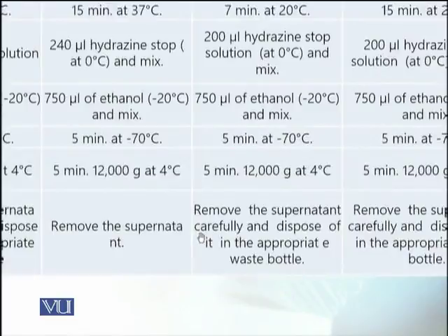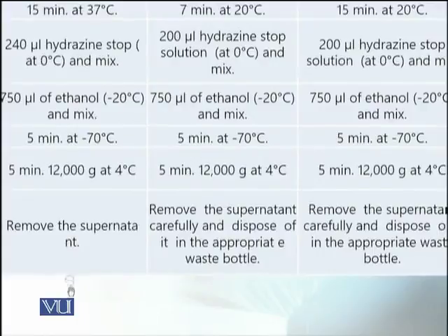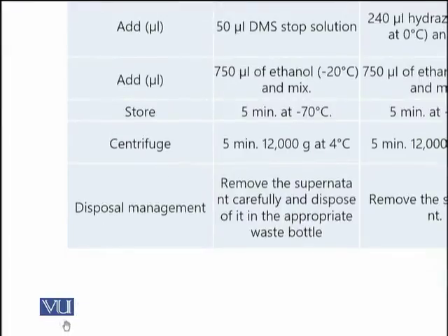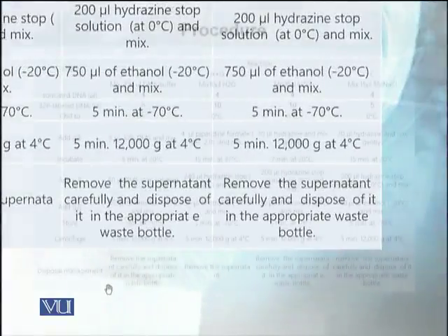Once these modifiers are added, we have to go through a series of steps that involve centrifugation as well as lyophilization.